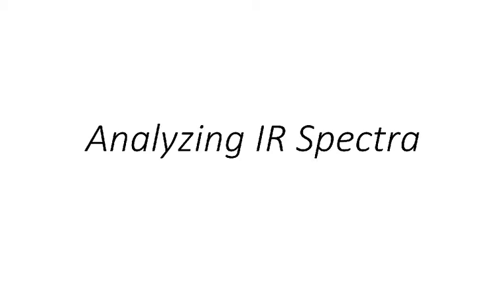This is the second of a couple videos on IR spectroscopy. In the previous video, we talked a little bit more about the theory behind IR spectroscopy, and in this one, we're going to be a little bit more practical. Now, I'm going to share with you some tips that I use in analyzing spectra.